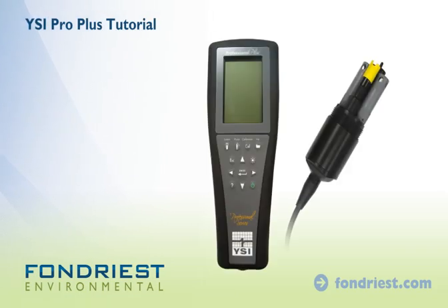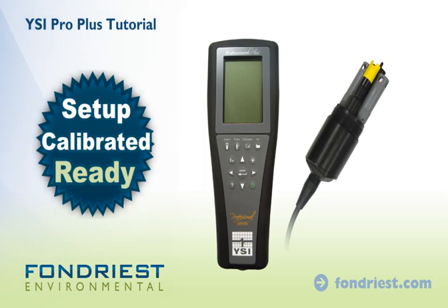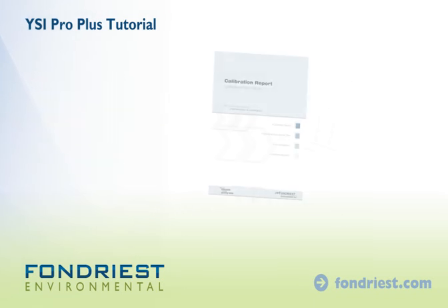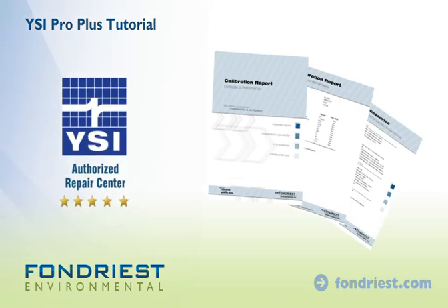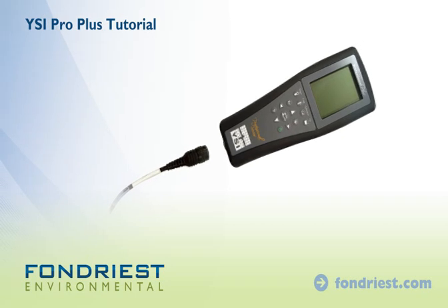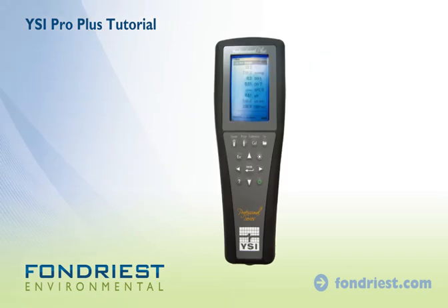The YSI Pro Plus with Quattro cable and probe assembly ships set up, calibrated, and ready. It arrives with a certified calibration report from our YSI authorized service center. Simply connect the cable to the meter and power up. The meter will start in run mode.